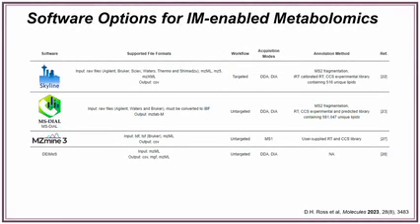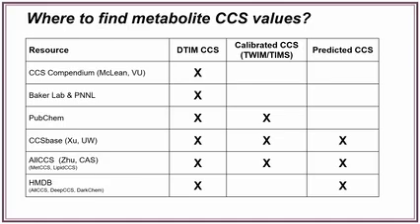So, you've done ion mobility, and you have CCS values that you want to compare and see if you've actually matched up to some stuff.